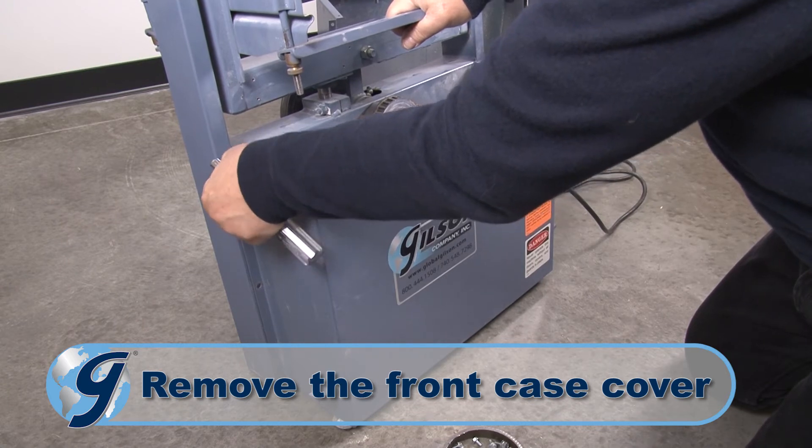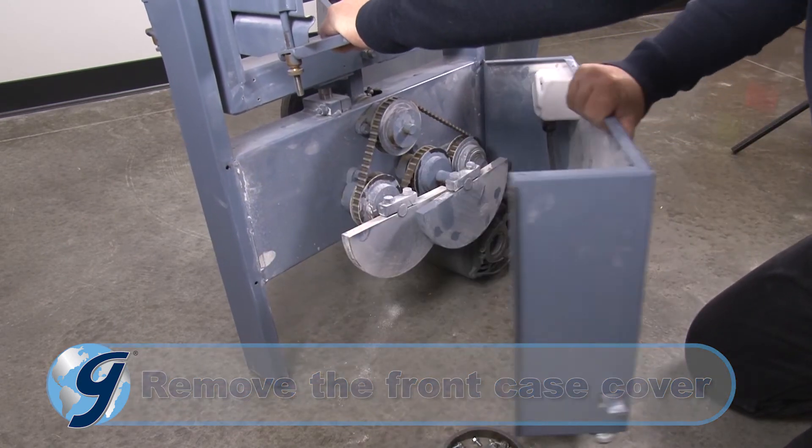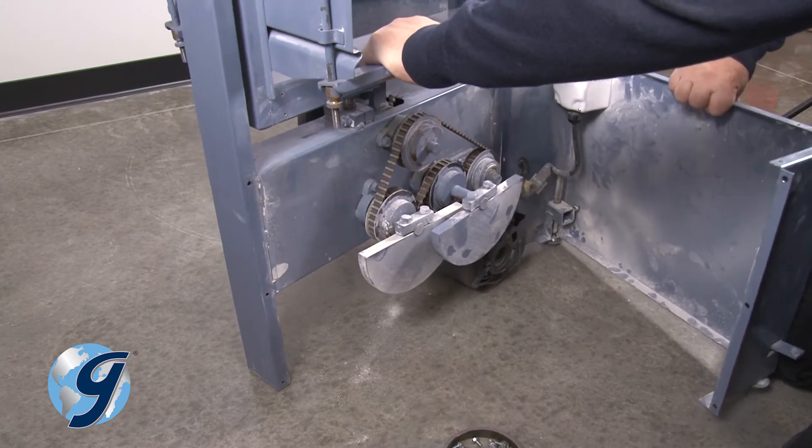Next, remove the six screws of the front case cover and carefully set the case cover close to the unit so as not to stretch the digital timer wiring.